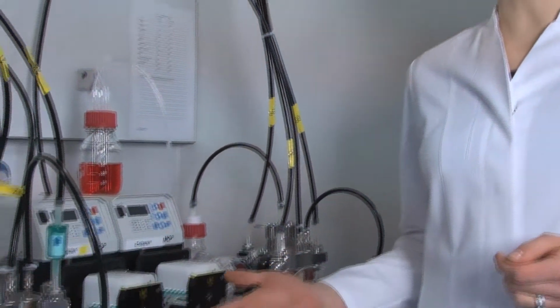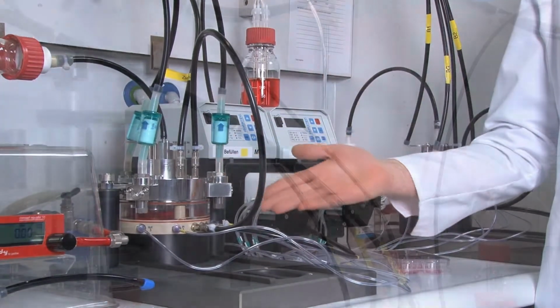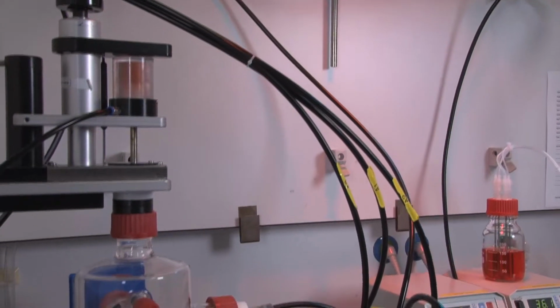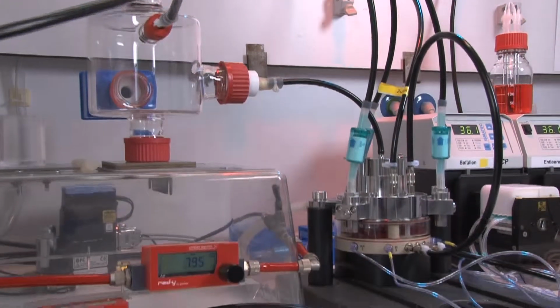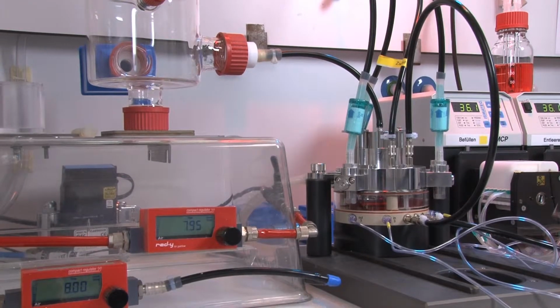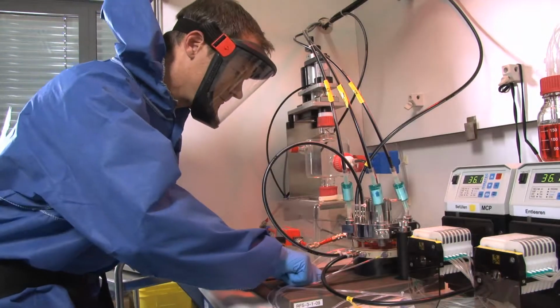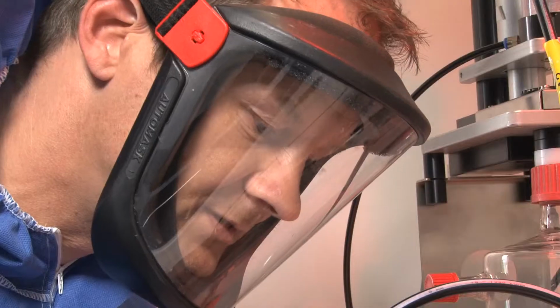Let's take a look at a couple of typical setups. Here, for example, we have a setup for the exposure to particle-containing atmospheres. One challenge is to guarantee the homogeneous distribution and deposition of the test atmosphere, for example particles, on the cell cultures. Desired and representative results can only be achieved by direct particle-cell contact.